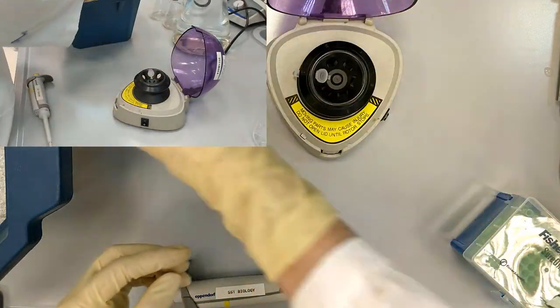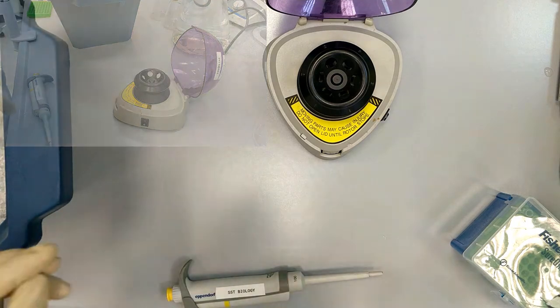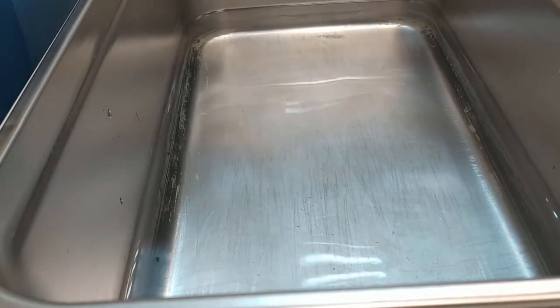Okay, now we transfer this mixture into the water bath, which is set to 37 degrees. And we place our samples inside the water bath.